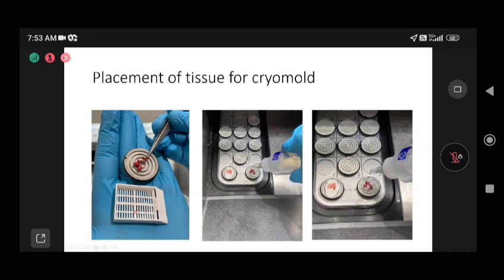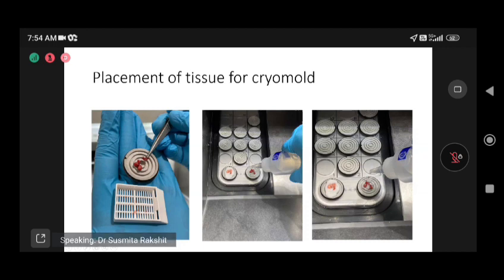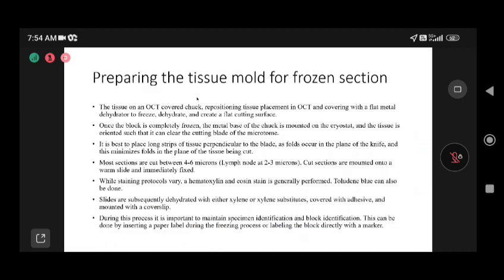This is the cassette used to bring tissue from the grossing area. The lymph node is cut and placed on the chuck with its cut surface facing correctly. The OCT media is poured over it. Once poured, it is kept in the freezing cryostat chamber, where it starts freezing, becomes hard, and forms a cryo mold.